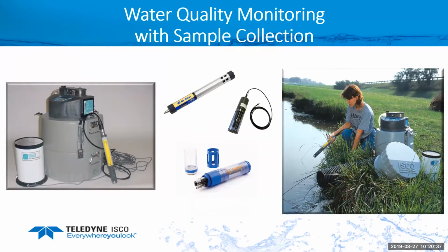Now the 6712, it speaks SDI-12 natively. If you have something that speaks Modbus, that can be fed into the 2105, which also speaks SDI-12, which is a very common communication protocol for sondes, for multi-parameter sondes. On the right here, you can see the young lady holding a YSI sonde. She's going to put that in the water, and that's going to run the sampler. And then they have a rain gauge off to the side they're going to mount.